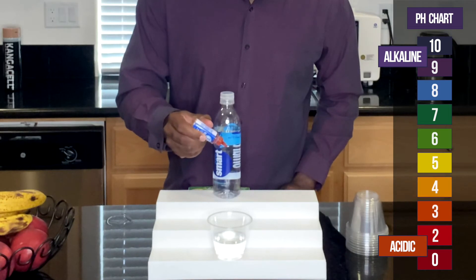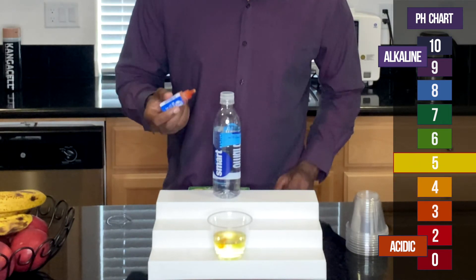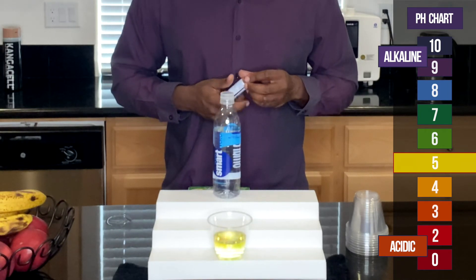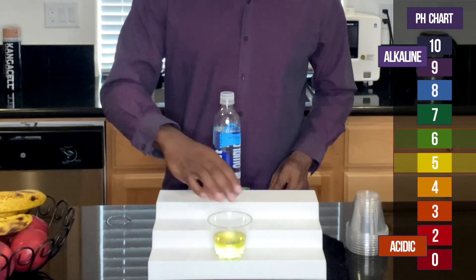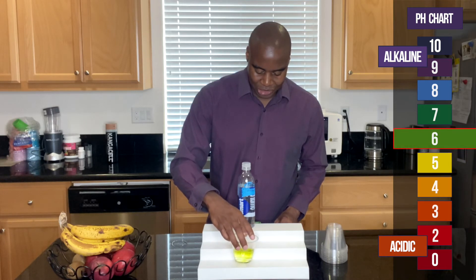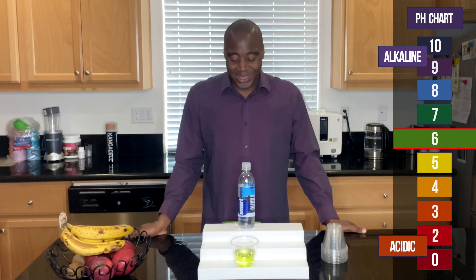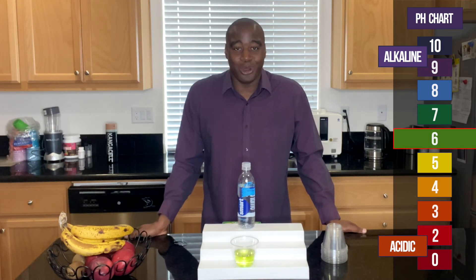Let's see it. Just want to make sure that we got a good accurate picture of the color of the water that is in here. And so there you have it — there is the pH of the smart water.